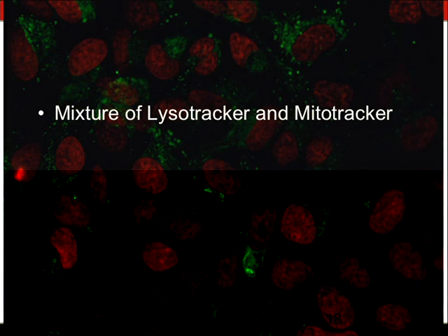Okay? So what we did, using automated microscopy in collaboration with colleagues at the Genomic Research Institute of the Novartis Foundation, was generate a large collection of images for various mixtures of these two different probes, and make a grid of concentrations.